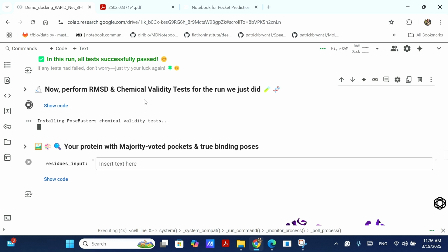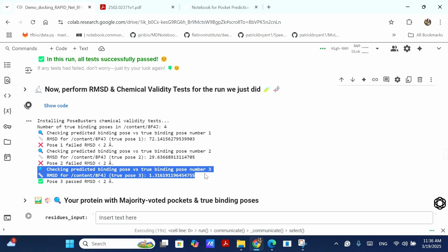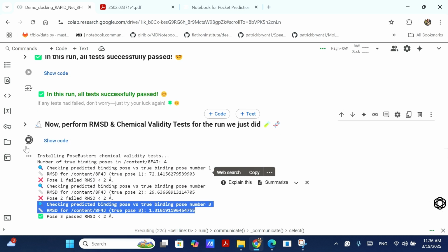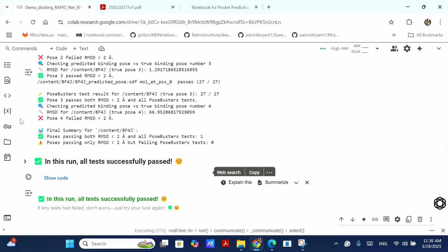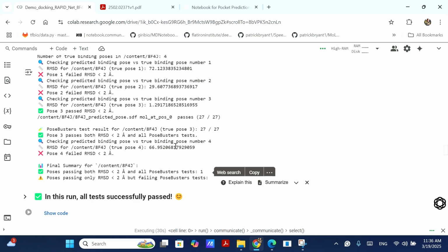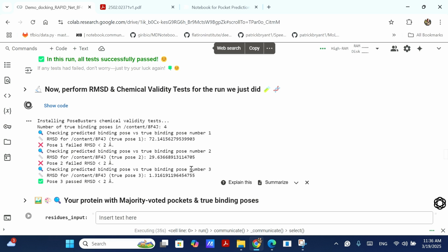Okay, so you are installing this. Now you can see this, right? The first pose is not our candidate. Second, no, it's not ours. But this one, we are actually matching this guy, right? So 1.3. Sometimes it jumps around this number a little bit because there is an element of randomness in docking. In this case I had 1.29, and in this case I'm having roughly 1.32.